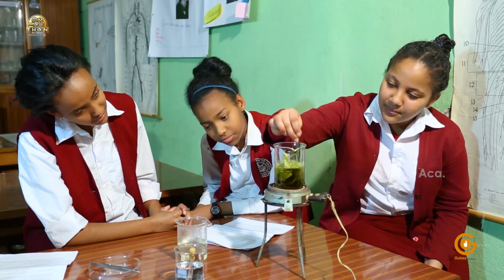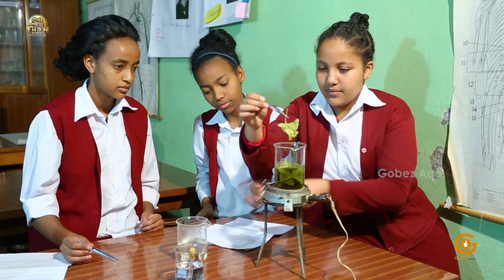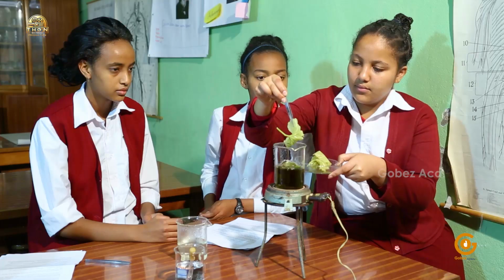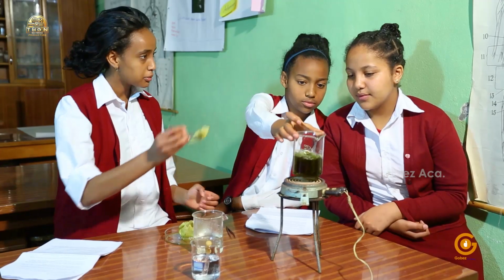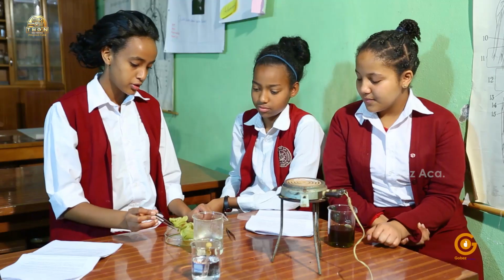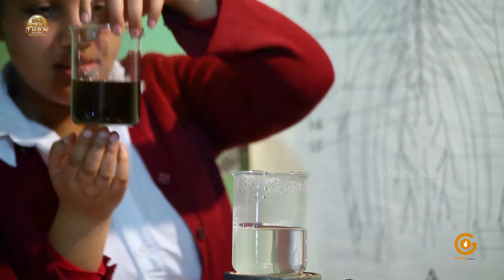I think it's enough now. Yes, it's enough. As we can see here, the leaf is hard and brittle and it can easily break. So we dip it in hot water to make it softer. But first, you can see how green this ethanol is. It's the color of the leaf.